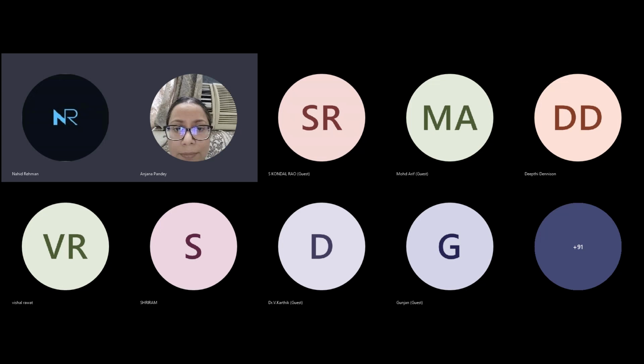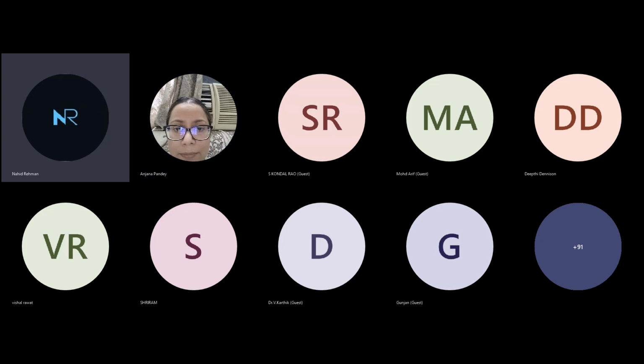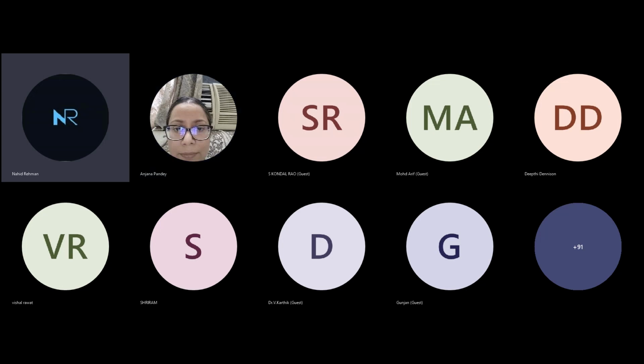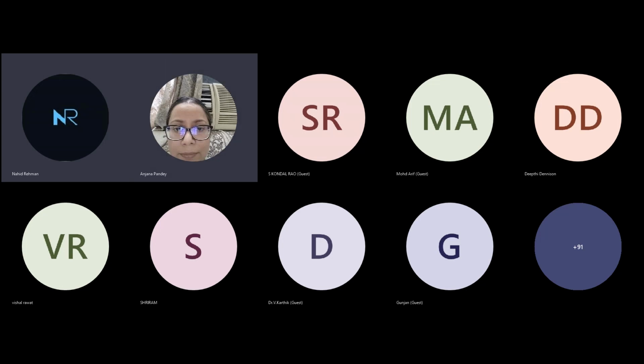Whether you check at any corner of your material, everywhere it will have the same lattice structure. And if the lattice structure is same, then your material, you characterize it using the XRD, X-ray crystallogram. You get the diffractogram, and that diffractogram gives you the specific peak.